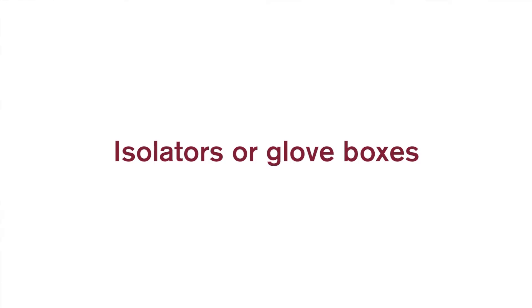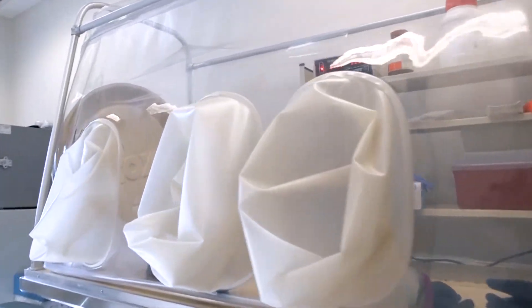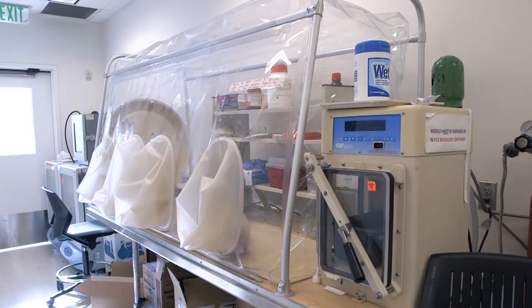Isolators or glove boxes are enclosed ventilation systems that can provide a controlled environment for handling chemicals. They do not provide a sterile environment. Inside the glove boxes, there is a working space that is completely separated from the environment around it.